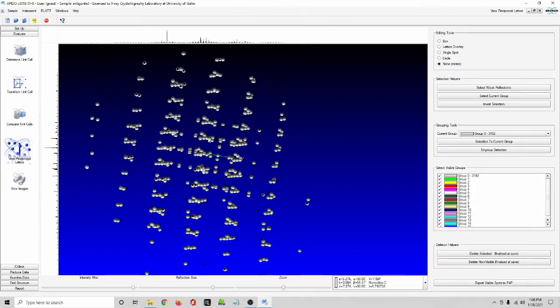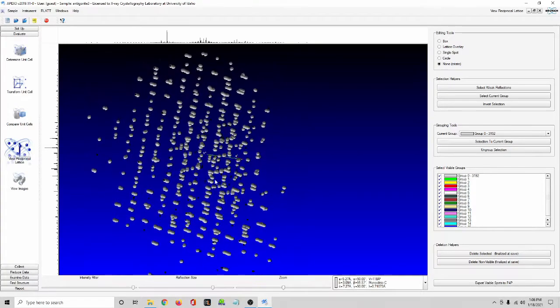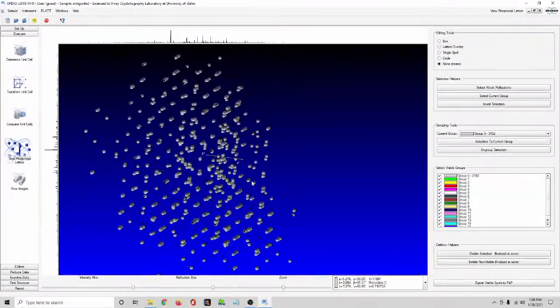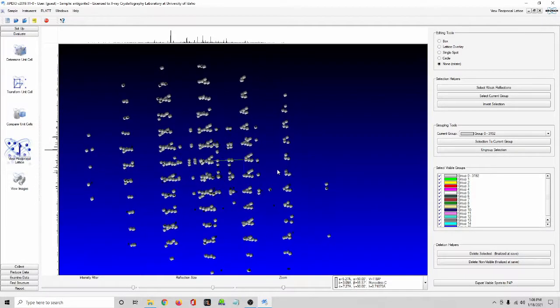You see these X's here where the reflections are crossing. So there's one, this is probably the dominant domain, the ones where you see the most reflections, and then there's a separate twin domain crossing it that's probably weaker. So that's another thing that's going to be a problem here, but we'll try to handle it.